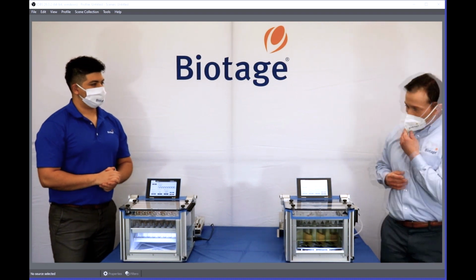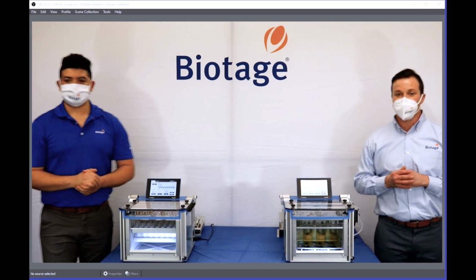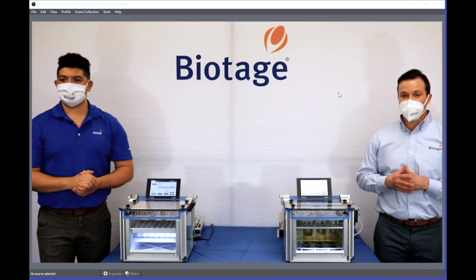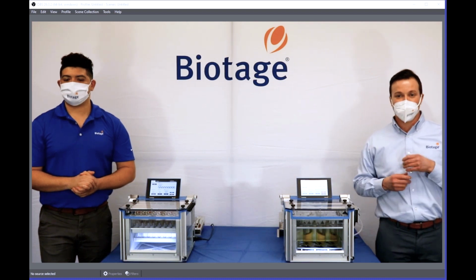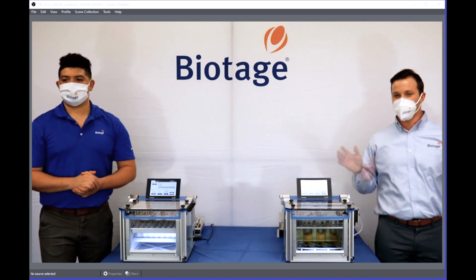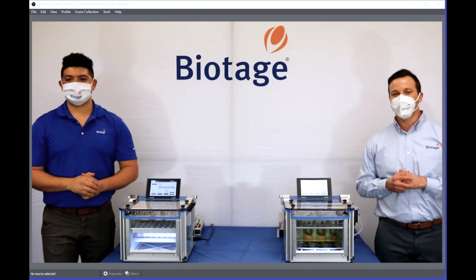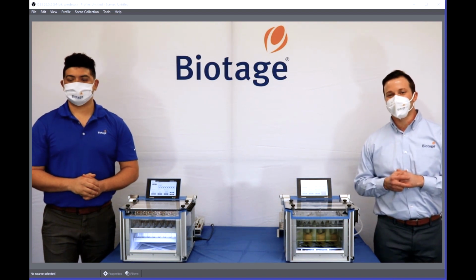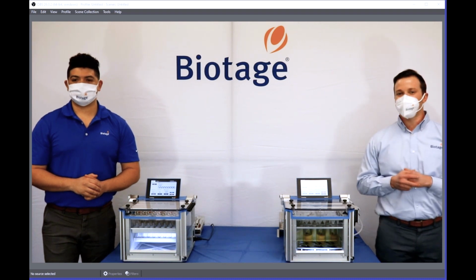So from there, we'd like to close out with a chance for you guys to ask some questions. Any comments on the new systems? I know it's a big change, and we're really excited to hear your feedback and any questions that you guys may have for us. And we're gonna let our camera woman, Sarah, who's doing a fantastic job, relay those questions to us. Someone wants to know if you have to use nitrogen or if you can use compressed air.